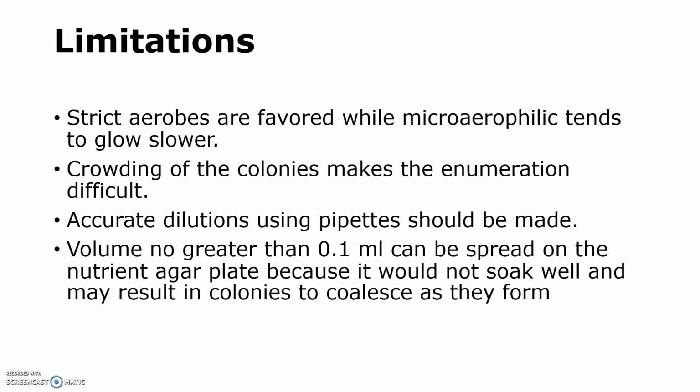Next, what are the limitations? Strict aerobes are favored while microaerophiles tend to grow slower. There is a problem of crowding of the colonies, which makes the counting or enumeration of colonies difficult. Accurate dilutions using pipettes should be made, so using pipettes we can take accurate dilutions such as 0.1 ml.